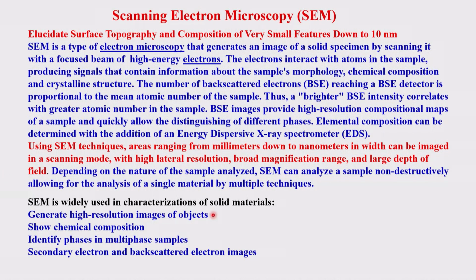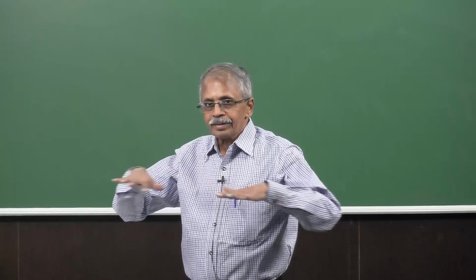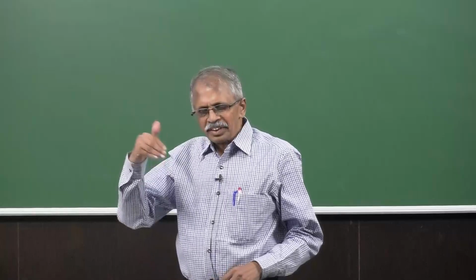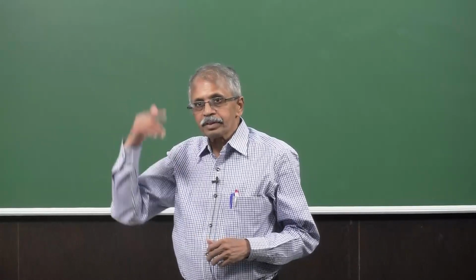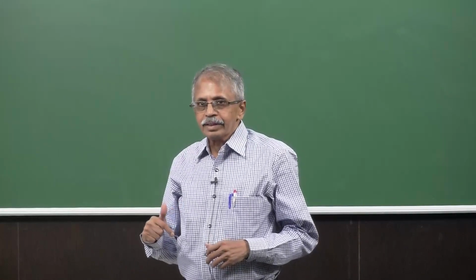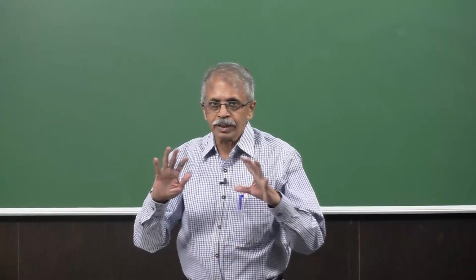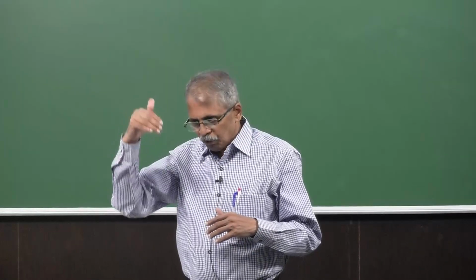All this can give you a range from the millimeters down to the nanometers, with a very good lateral resolution, meaning XY, and to some extent Z also. You don't see the transmitted electrons, which you will see in the TEM, but you will see some level of depth, as if it looks three-dimensional, though it is not completely, because you don't see full transmission.